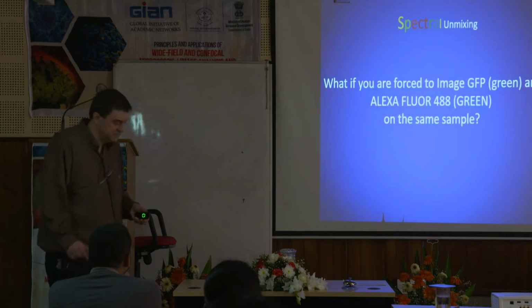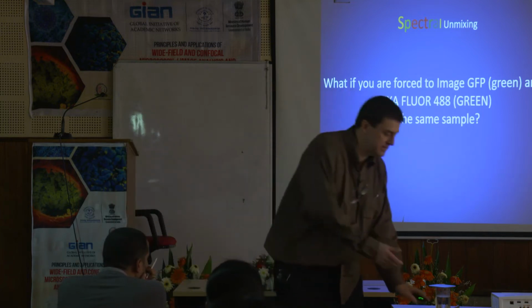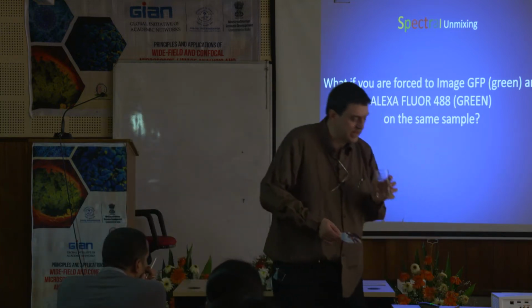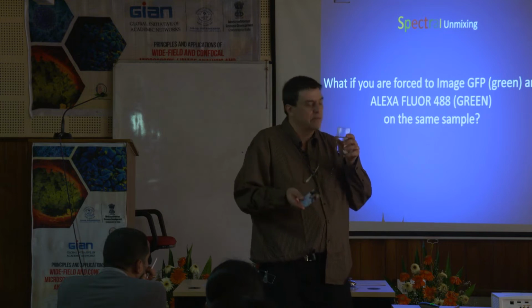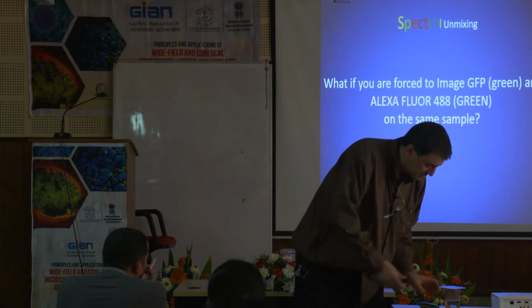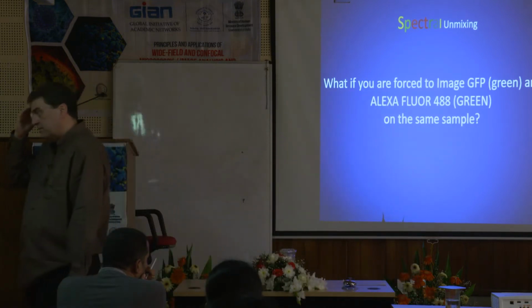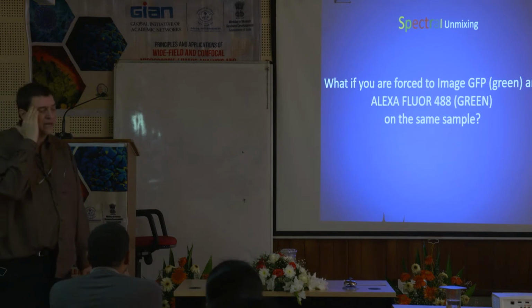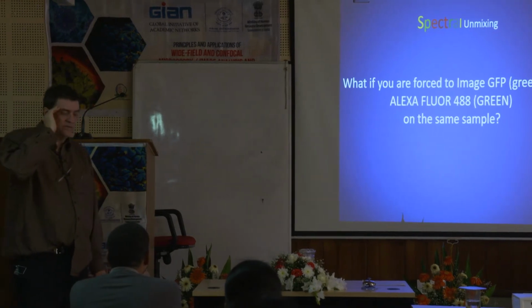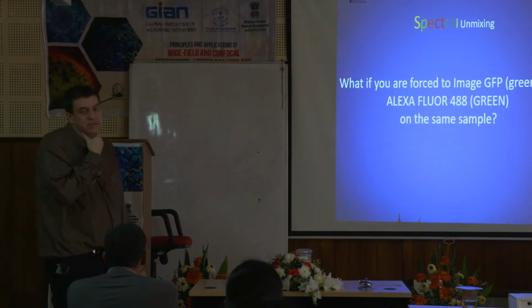Okay, so this came up yesterday. Somebody had asked me a question. They work with plants or something. Now this is going on to a pretty advanced technique. I'm sure you don't have it on this instrument. We have it on a couple, I think we have it on one at Case, maybe. It's pretty expensive, but sometimes you might have to go find it if this is your problem. There's a thing called spectral unmixing.